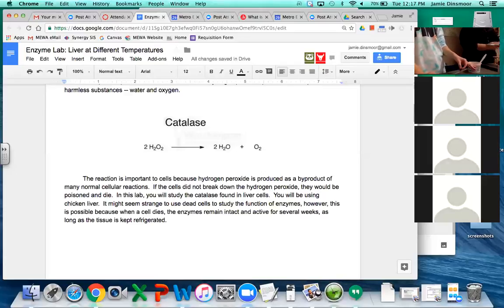Imagine if you got your temperature taken with the liver. I know. You know, I never imagined myself doing the announcements and then now touching chicken liver for a virtual lesson. This isn't bad. Okay, so you guys ever pluck the feathers off the chicken? Have I? No. Oh, never mind. Wait. Oh, we're done.